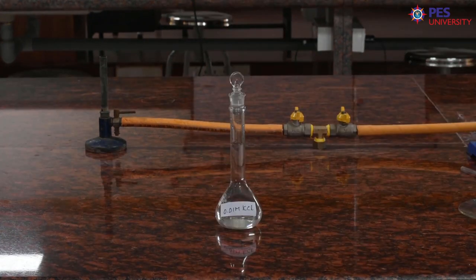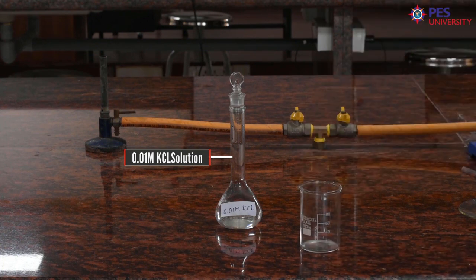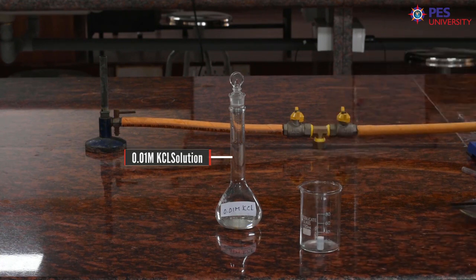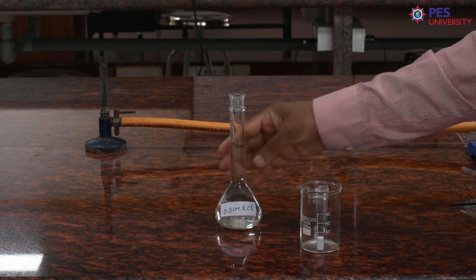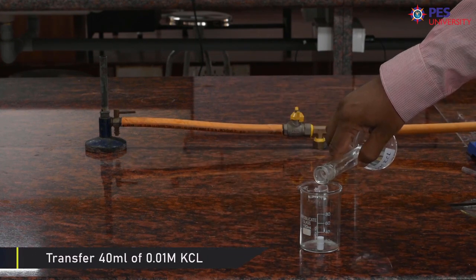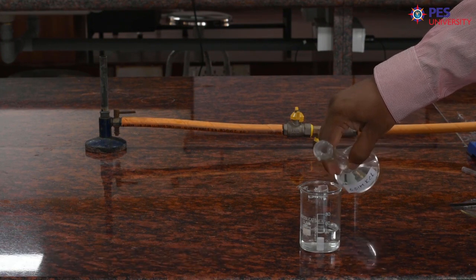After measuring conductance of 0.1 molar KCl solution, let us clean the beaker with distilled water. Then after cleaning the beaker, transfer the magnetic pellet inside the beaker. Then transfer roughly about 40 ml of 0.01 molar KCl into the 100 ml beaker.